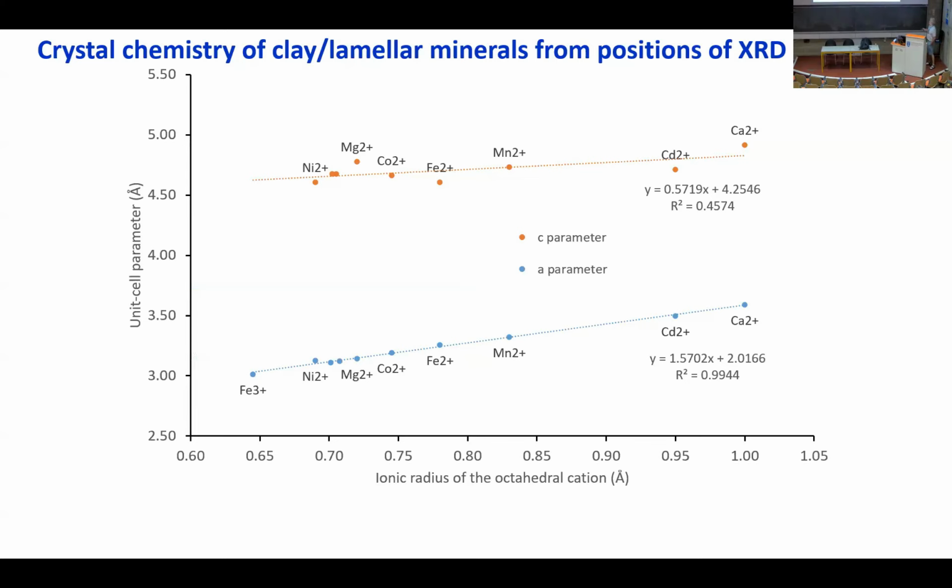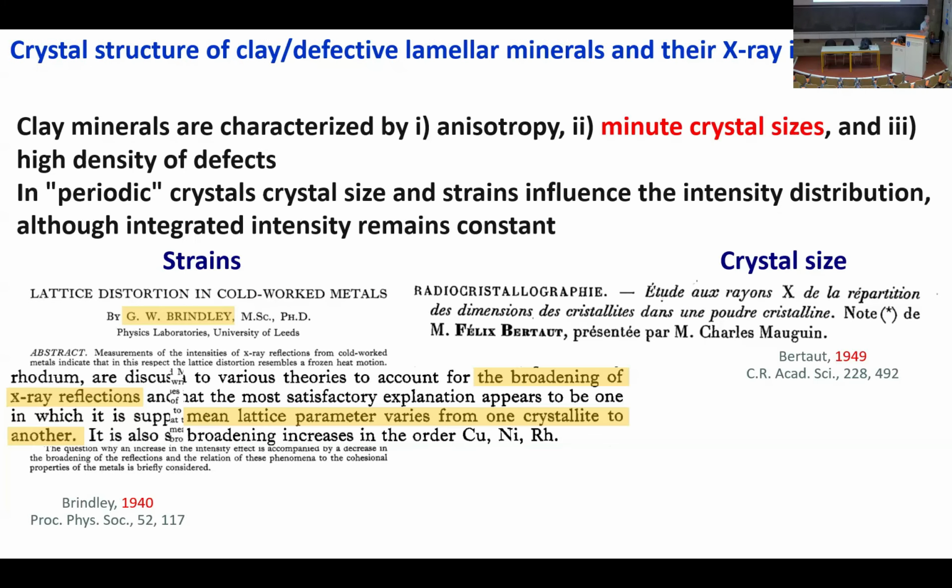So far, I've tried to show you what's possible to use for peak position only, but clearly you know that depending on what you will be recording data from, you will have sharp peaks, you will have much broader peaks, etc. And these peaks, in the case of clay minerals, essentially come from their small crystal size. And small crystal size could be due actually to two things.